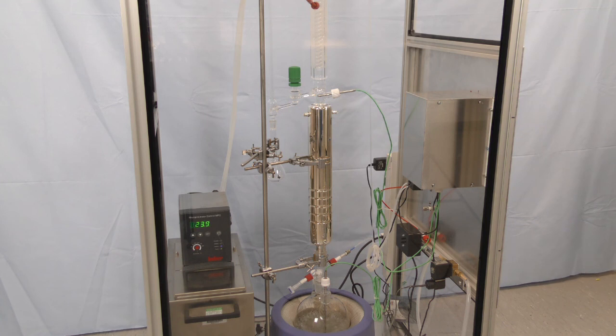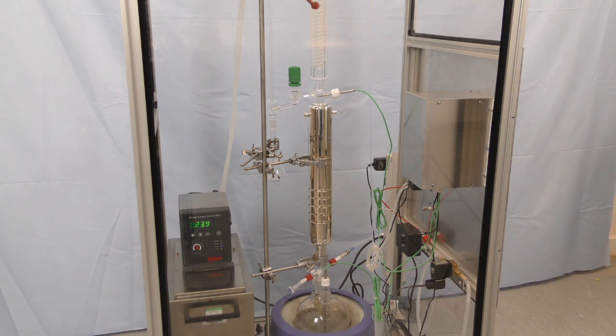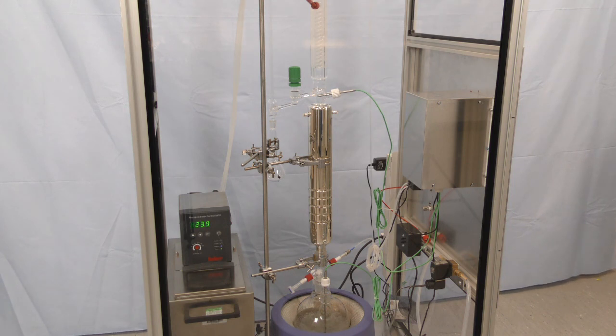Here's the apparatus I showed you in the previous video. We have the reboiler at the bottom, the silvered column containing ten sieve plates in the middle, and a water-cooled reflux condenser at the top.